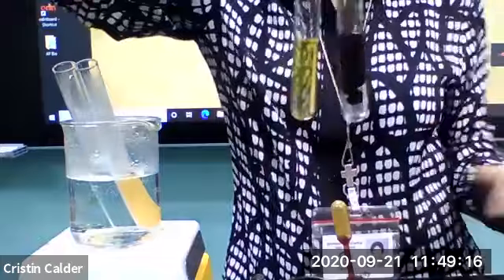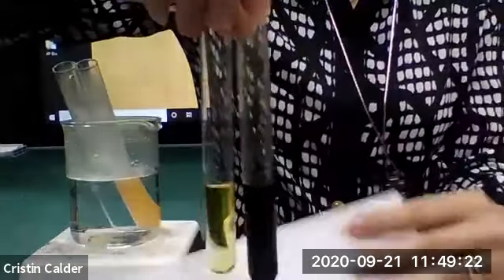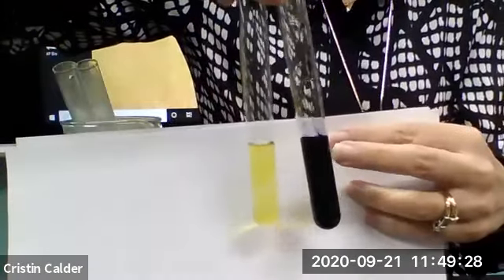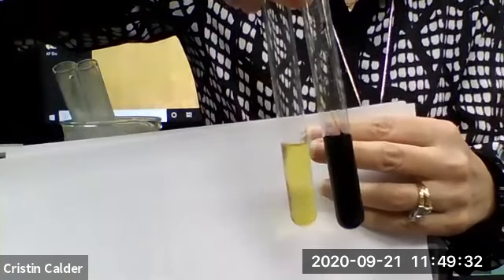Okay, so for my standard, I can get a white piece of paper so you can see these results a little bit better. Here we go. Positive test right here. This is my standard. Notice it turns a bluish black color. And then my negative test, if something does not have starch, my water just simply turns kind of an amber color. All right, so that's my Lugol's test for starch.